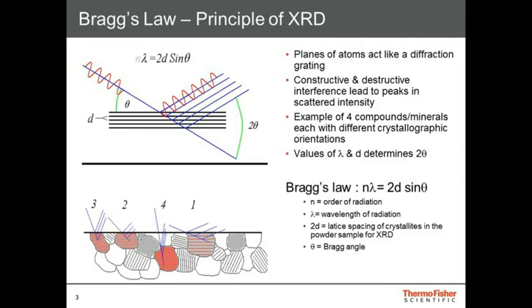In a periodical 3D arrangement of atoms in a solid compound, the atoms form some planes, and these planes can act as a grating, and our X-rays get scattered at this grating, which also leads to a diffraction pattern similar to the one which is formed by the light.